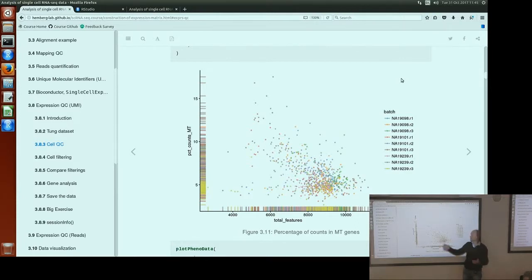Sometimes this could go up to 80%, so it's very hard to say. You could have a batch effect on this plot as well. It's just that in this experiment, we can see the batch effect in the spikings, but not in mitochondrial genes. But it's not always the case. So it's always, with these two plots, a manual selection of cells that you want to remove. And the advice is to remove some outliers, right? Keep the majority of cells in the data set, remove the outliers.